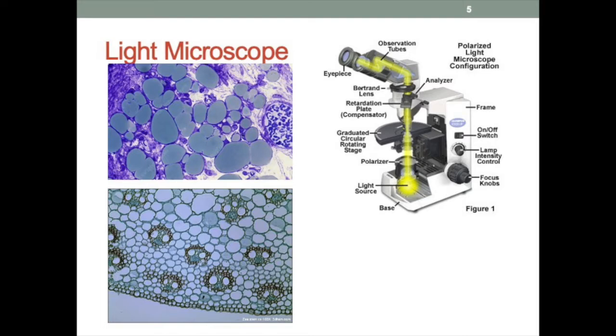And then the light microscope, the ones we would have used in lab, are used in most universities and colleges because they're mostly used for learning, and they're pretty widespread. We can see cells, and some organelles like nuclei, stained cells, and organelles like mitochondria and chloroplasts.